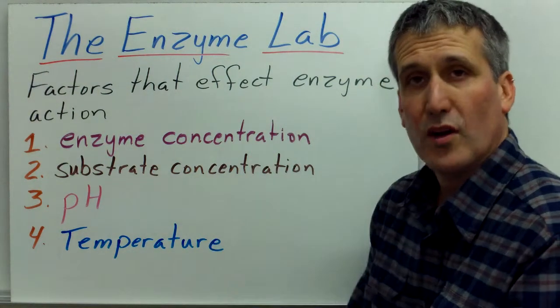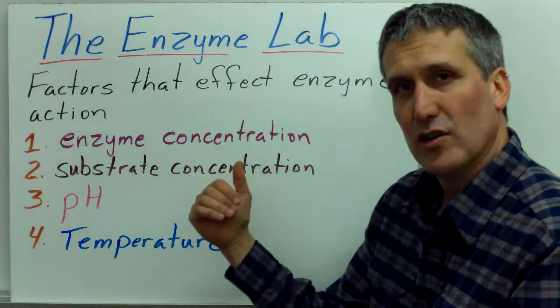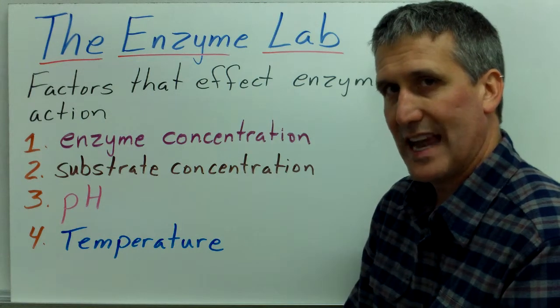Welcome. In this video, we're going to talk about the enzyme lab. This lab has us look at factors that can affect the rate of reaction, or the factors that affect enzyme action.